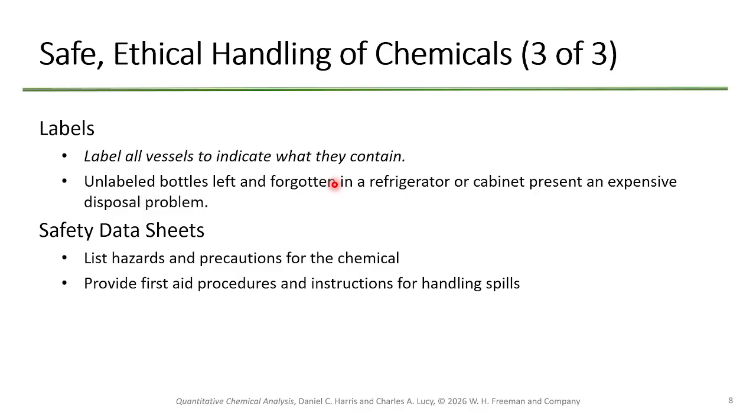Anybody know what sodium hydroxide does to glass? It reacts with it. It actually dissolves the glass. Or HF, hydrofluoric acid, also dissolves glass. Okay? And so leaving it in glass is probably not a great idea, is it? Yeah. In fact, has anybody seen the syringes that are fused together? Those are almost always because the sodium hydroxide was left in it. They rinsed it and put it back but didn't get all of it out. And so KOH or sodium hydroxide dissolved the glass, it dried out, and the glass is actually fused.